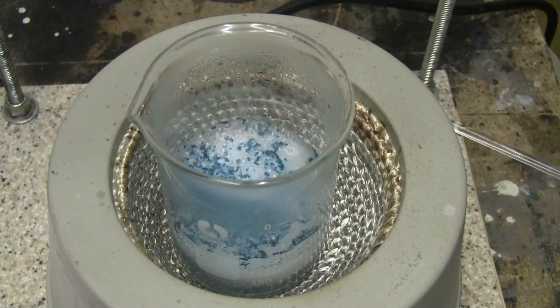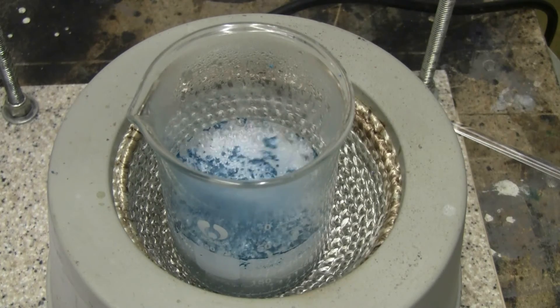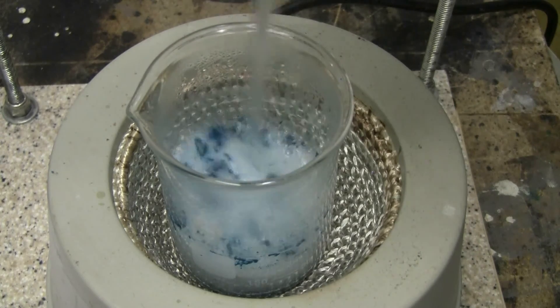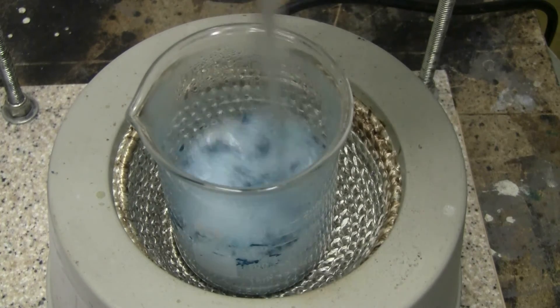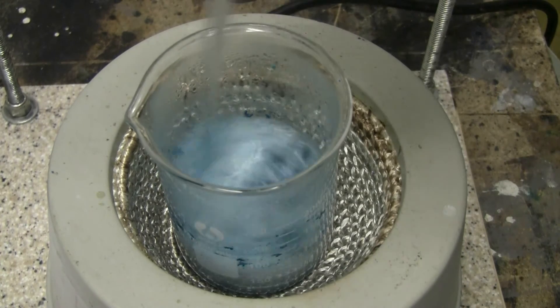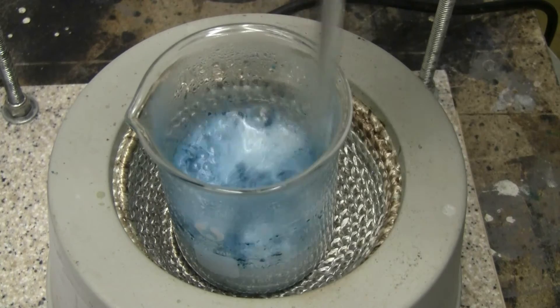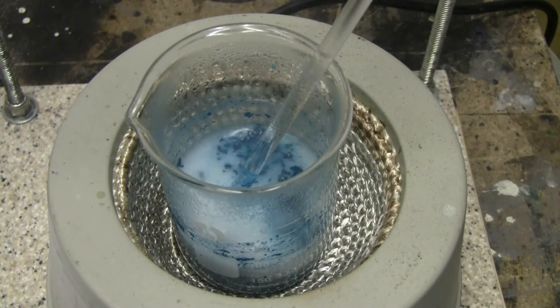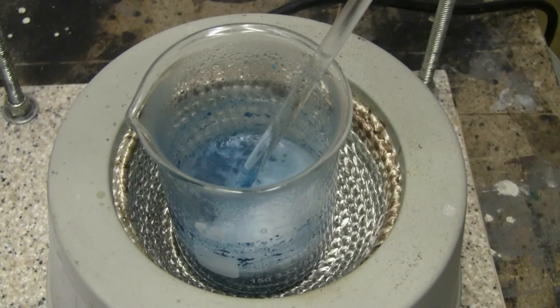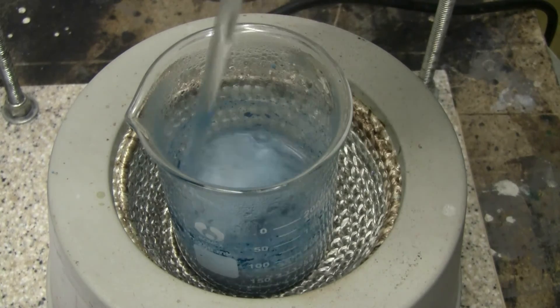The last of the copper carbonate has been added. The reaction is proceeding with plenty of CO2 being evolved. It's very soft as the reaction continues.